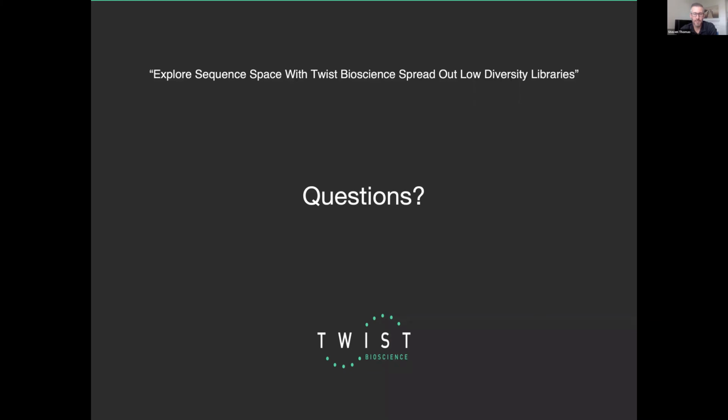Another clone question. This is a different take on the clone question. Can libraries be cloned and arrayed? If you are talking about a site variant library, yes. For site variant libraries, we offer cloning, and they are arrayed per position. If you remember, you're mutating one position at a time. Within that position, you can have anywhere from a single amino acid change to substituting in all 20 amino acids, or one single codon, or all 64 codons. So for an SVL, per position, each well will contain that set of variants.